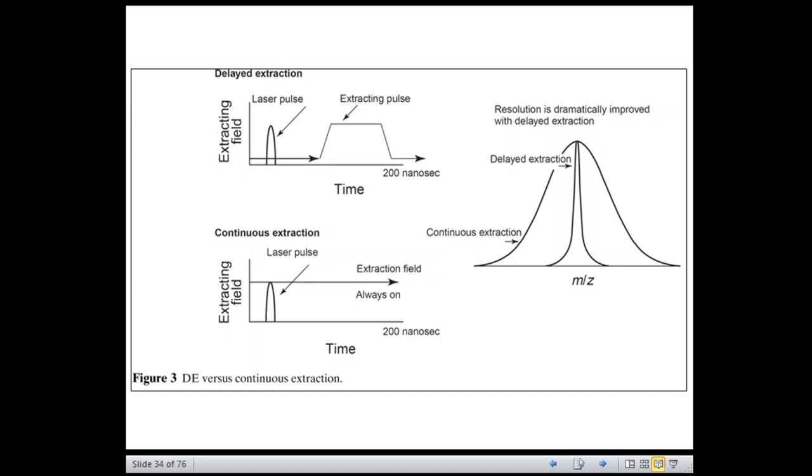The delayed extraction is a relatively simple means of cooling the ions, possibly focusing them immediately after the MALDI ionization event. That means as soon as the ionization happens, they are not immediately pushed to the analyzer.